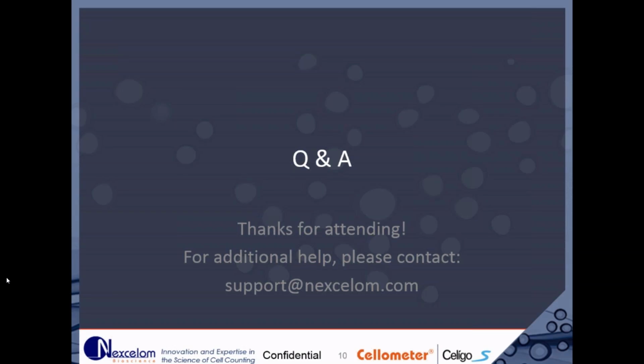I would say that it just didn't have a bigger dynamic range because it's actually divided by the area of the cells, and there's some pixels that are super bright, and that gets averaged out. So before this webinar, I plotted both ways to see which is the best way. I felt the dynamic range was a lot more obvious in the integrated intensity.